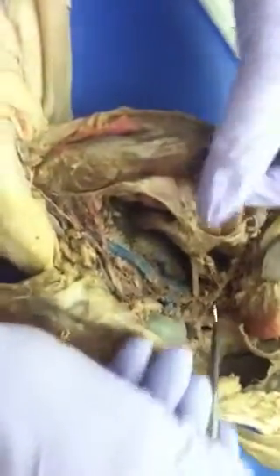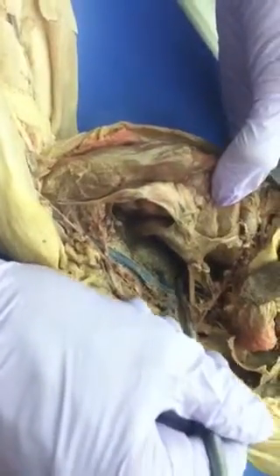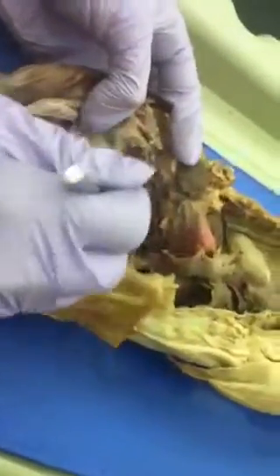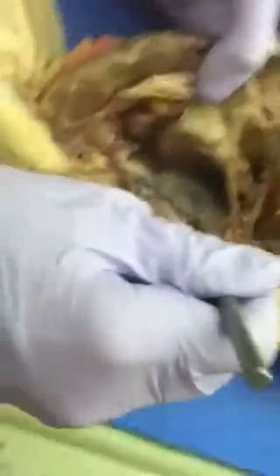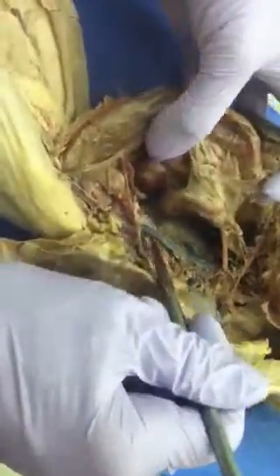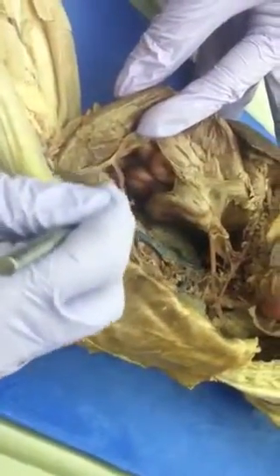Oh, wow. Okay. It's okay. It's so big. This is the superior mesenteric. That's going to the small intestine. See there? That's the superior mesenteric. This is the renal to the kidney. That's the kidney. And then the aorta continues down. I couldn't almost see it. Continues down. And somewhere here is the inferior mesenteric.